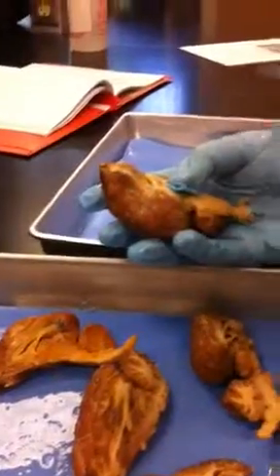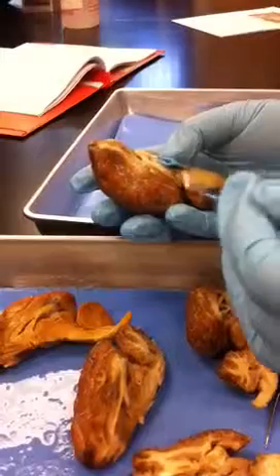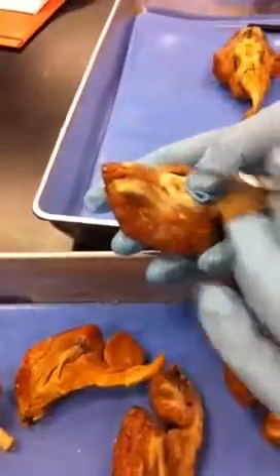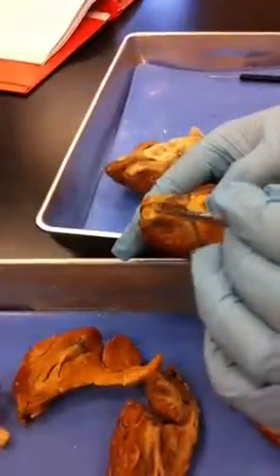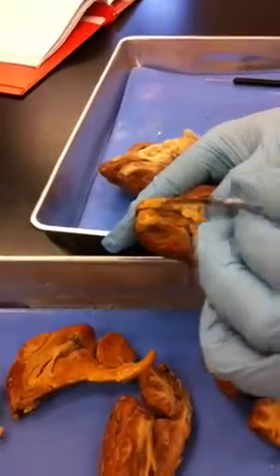Olfactory bulbs. They're larger comparatively than human olfactory bulbs because they rely heavily on the sense of smell. And so there's very large olfactory bulbs. This one's got a missing one right here, but this is all olfactory bulb right there. There's a couple more on here. See, these are olfactory bulbs right there. And so the nerves running right down there to the brain.